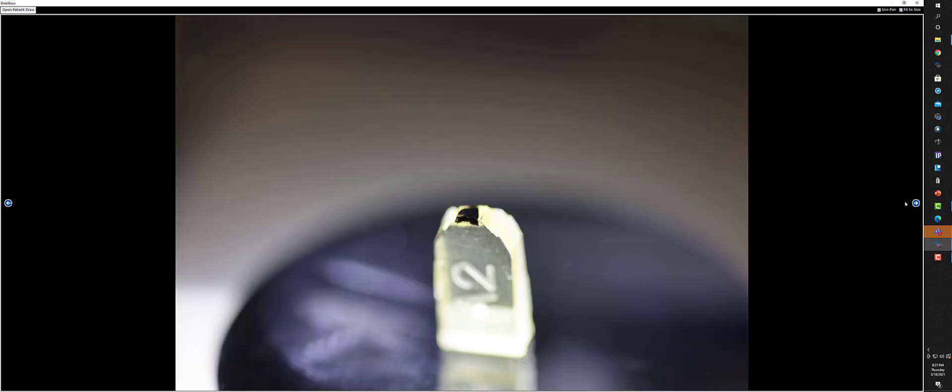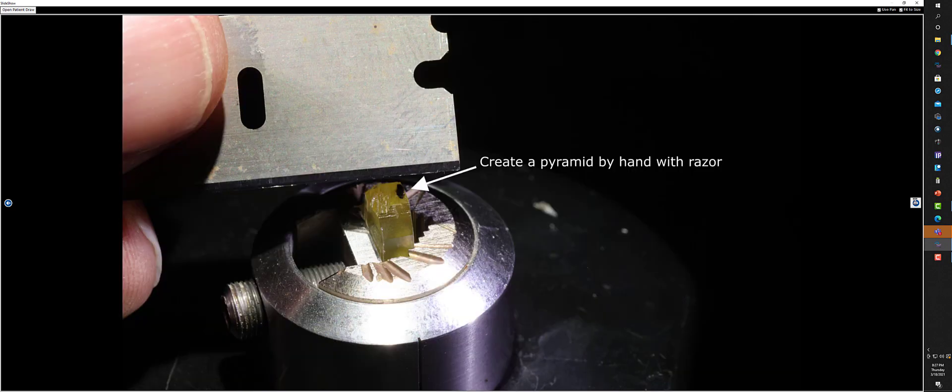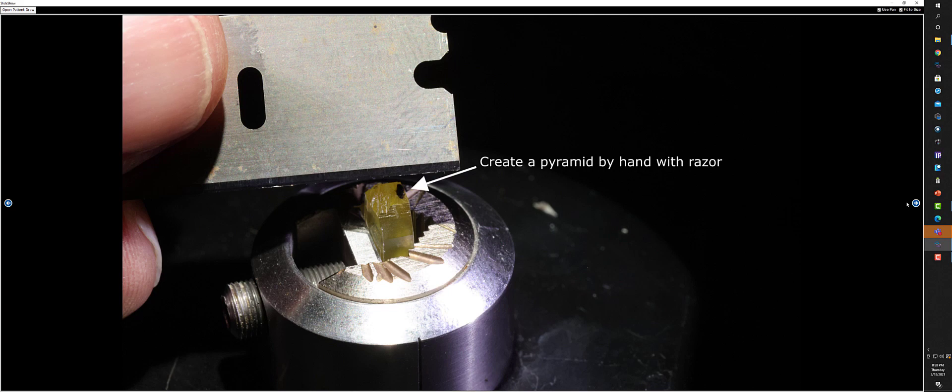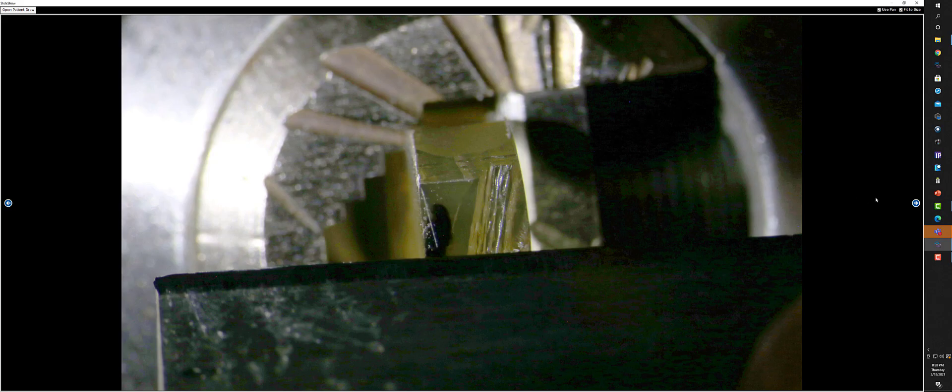Now you have to actually prepare the block for sectioning in an ultramicrotome. So you create what's called a pyramid, and you do this by hand with a razor blade, and it has to be done very carefully because the dimensions are very critical. It has to be an equilateral kind of pyramid where the sides are at specific angles and very sharp.